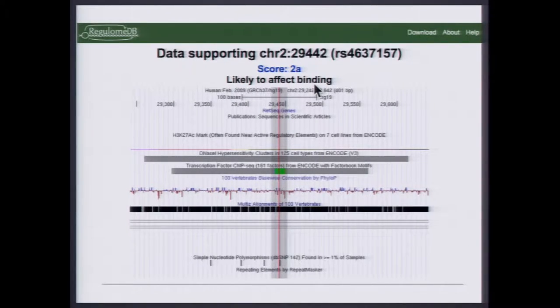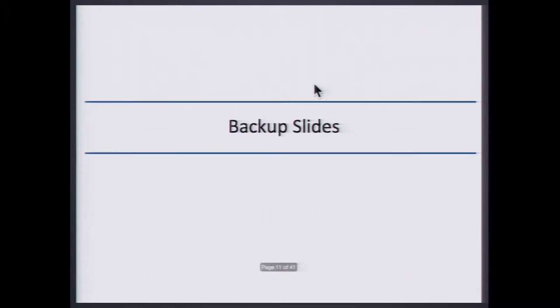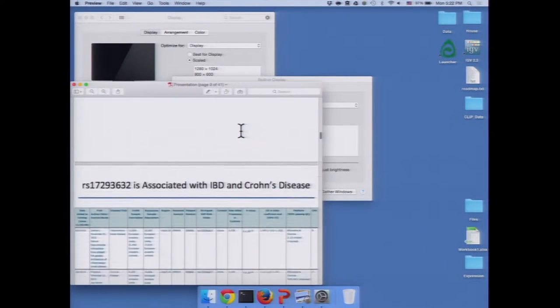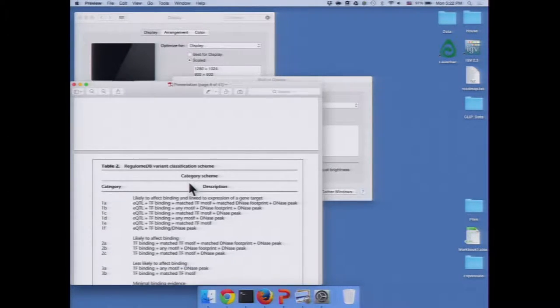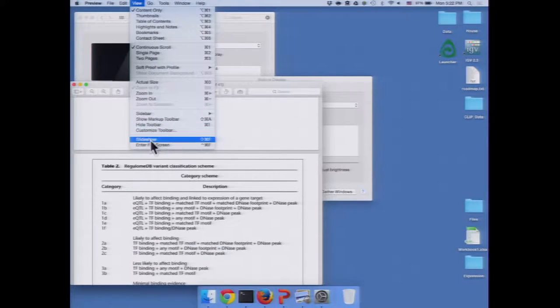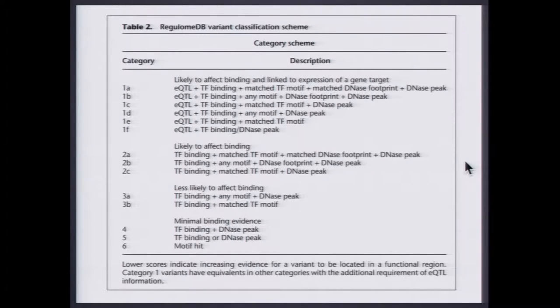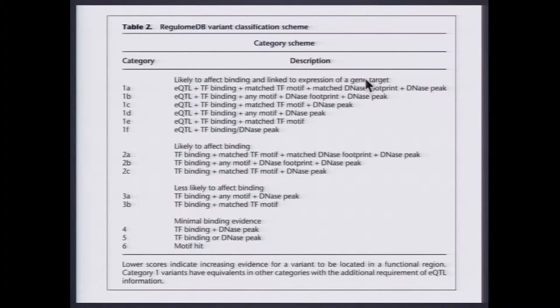If we click on our top SNP, we can see it has a score of 2A, which is likely to affect transcription factor binding. There are different categories depending on which line of evidence overlaps each variant. Category 1 is for variants that have been reported as eQTLs in different published studies. You can break those down further based on whether they overlap a transcription factor binding site from ENCODE, and whether they also overlap a motif. If this motif matches the same transcription factor found in ENCODE, it has a higher score. We also have DNA footprinting data — a small region of DNA actually protected from DNase I — and you can look for a transcription factor motif there as even stronger evidence.